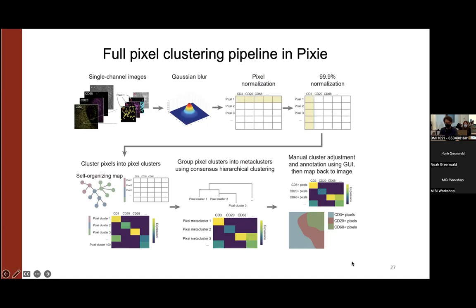In the CODEX data set, there is lots of noise, but you included the autofluorescence channel. So after the normalization step, the autofluorescence channel will have a peak there. So I'm thinking about the limitations. This probably wouldn't work for CODEX without autofluorescence, or for other imaging modalities that are super noisy and have no noise channel, right? Or would it? Where would it break?